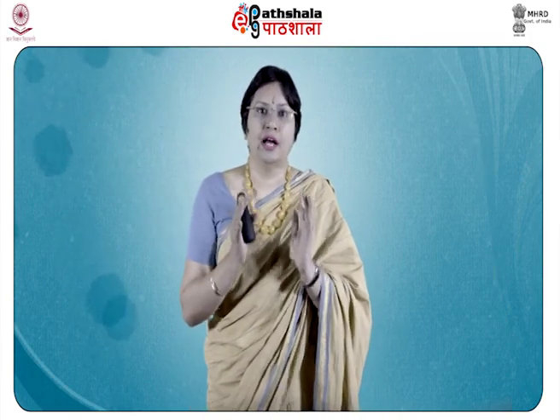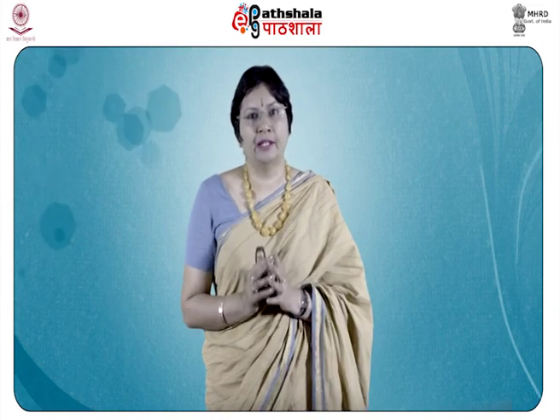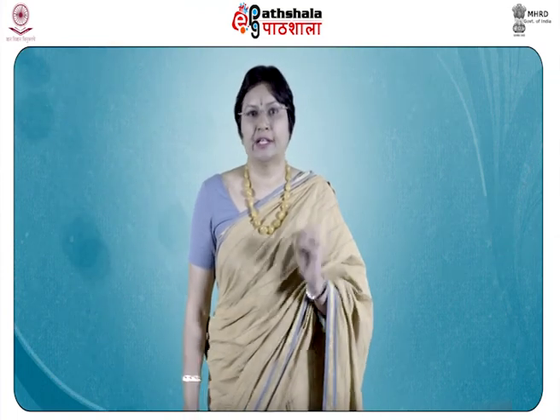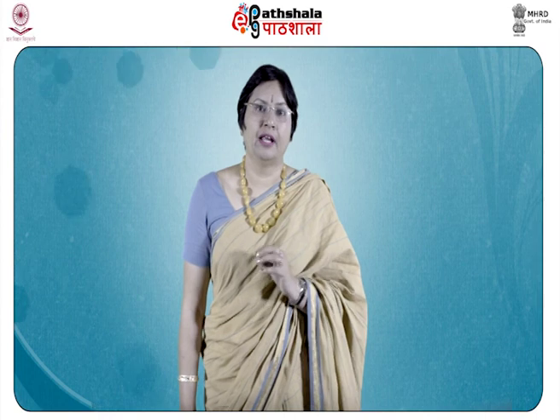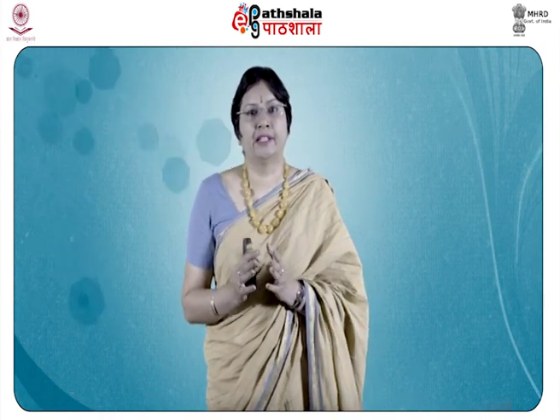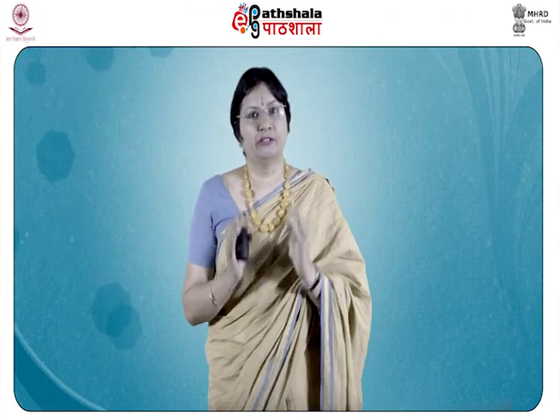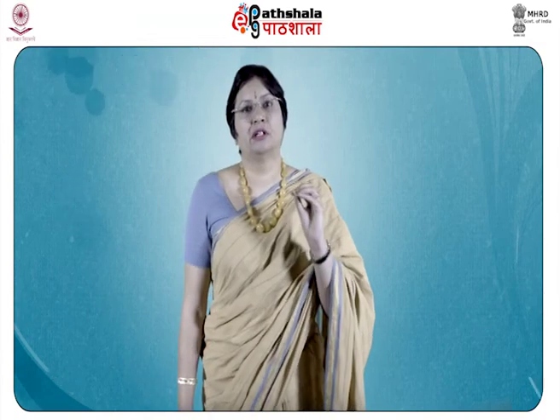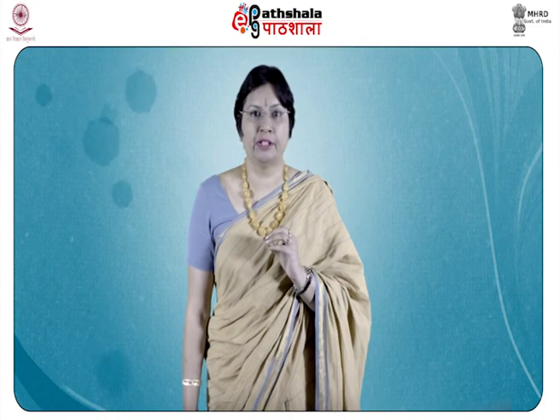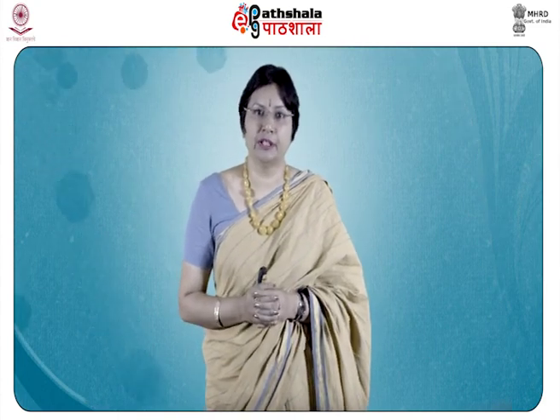So, after knowing all these tests, I am sure you will be able to analyze the post blast residue and find out what cations and anions are present and correlate them with the cations and anions present in that type of explosive material. It will give a clue as to the type of bomb or the explosive material that was responsible for creating that explosion in the scene of crime.